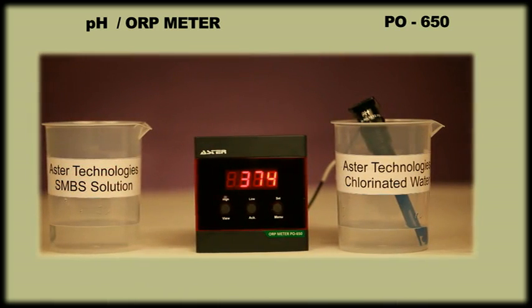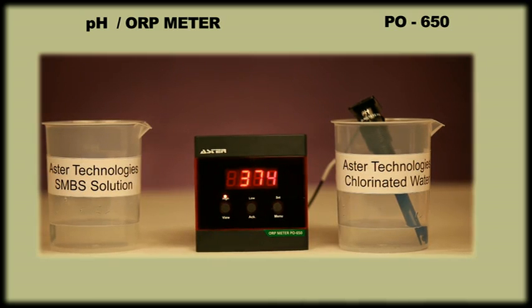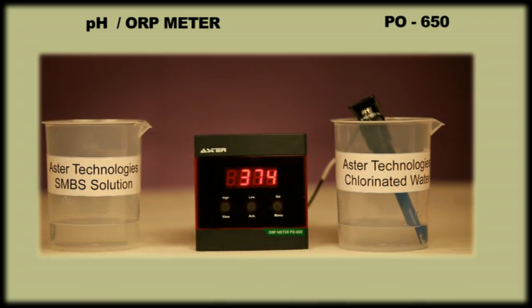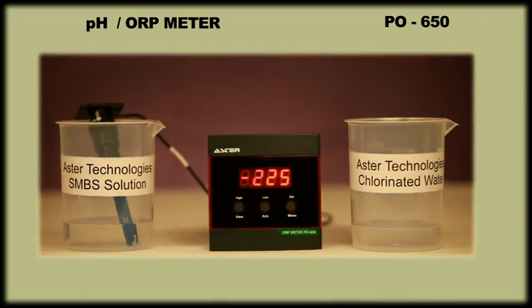Whereas, an ORP meter is used to measure the oxidation reduction potential. In the water and waste water treatment industry, chlorine and ozone are the most common disinfectants used. The ORP meter monitors the level of residual chlorine or ozone in water.